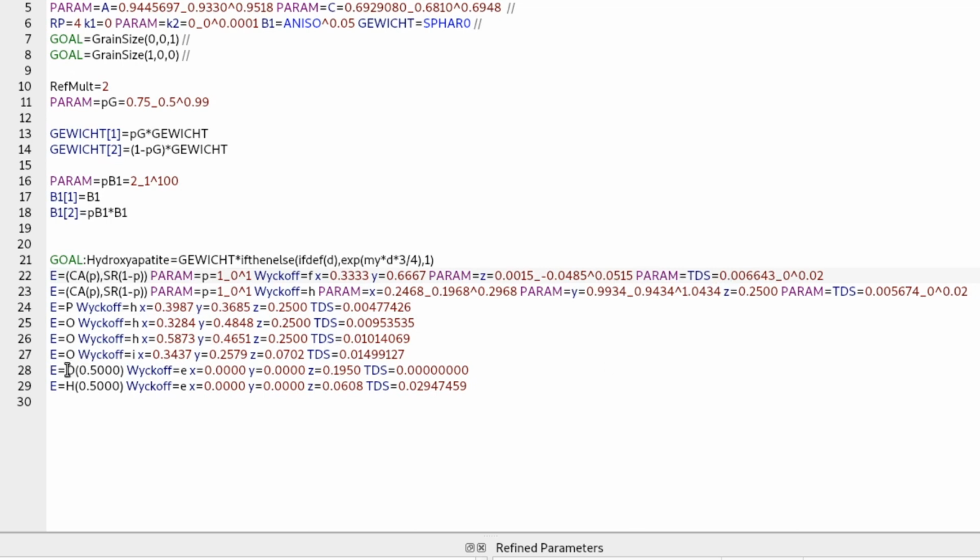And I also see that the O4, that's the oxygen of the OH group, has a wrong thermal displacement parameter. It was not given in the structure model in the template, but we should give some value. It's certainly not 0. It's probably blurred quite a bit because this OH group is also rather flexible. Let's try this. It's certainly better than 0, and we might even refine it.